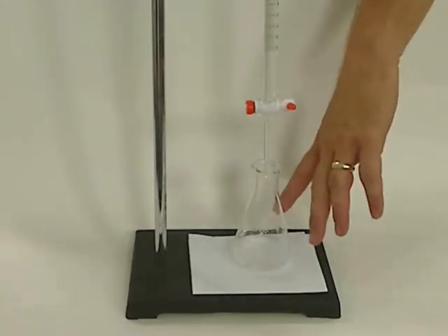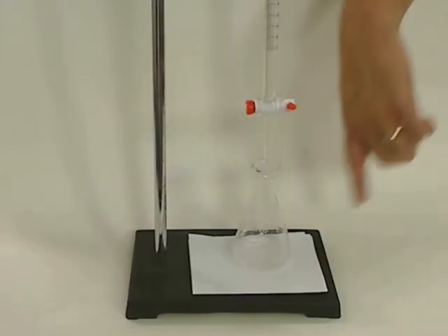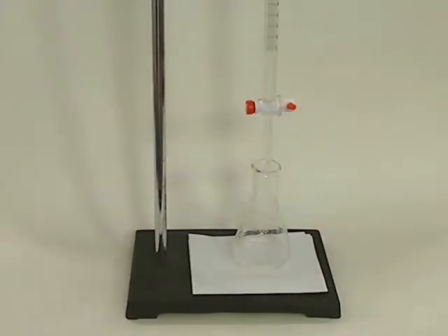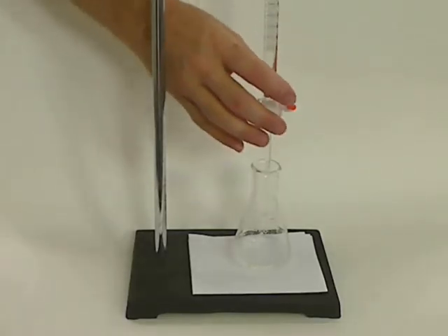I always put my Erlenmeyer flask on a white surface so it's very easy to see the color of the indicator. And then I practice using the burette.